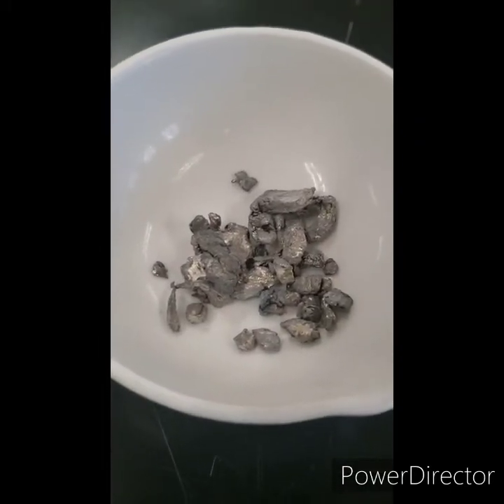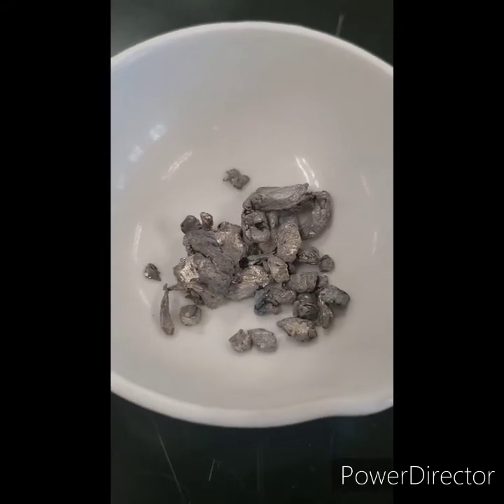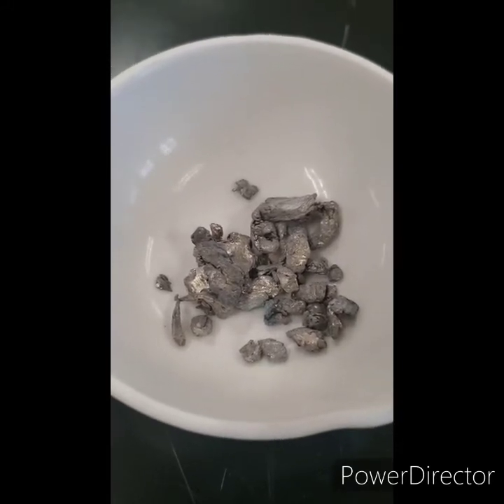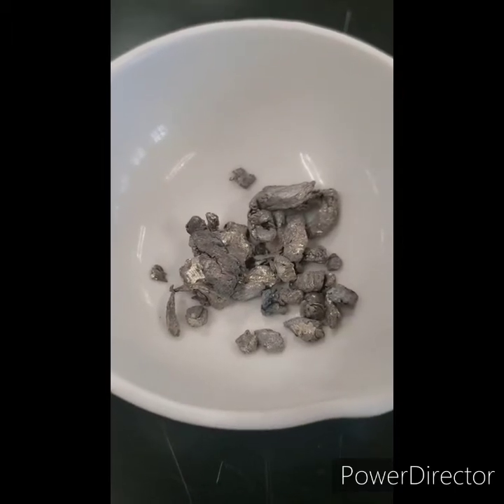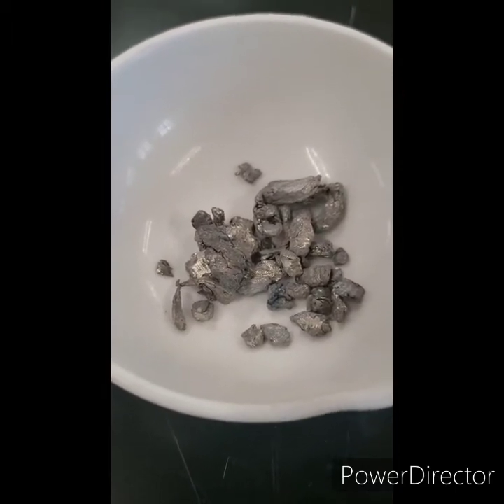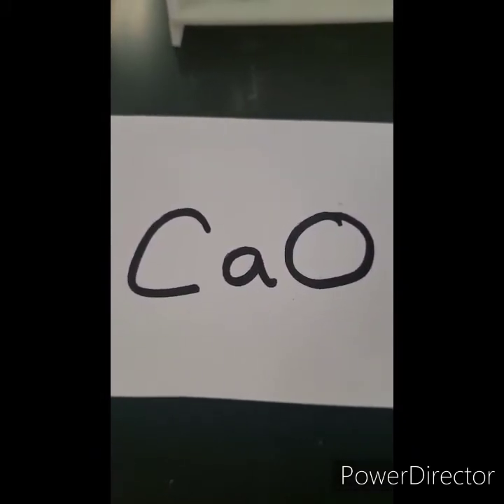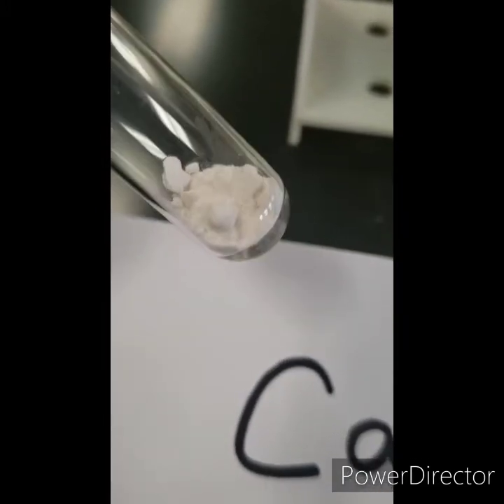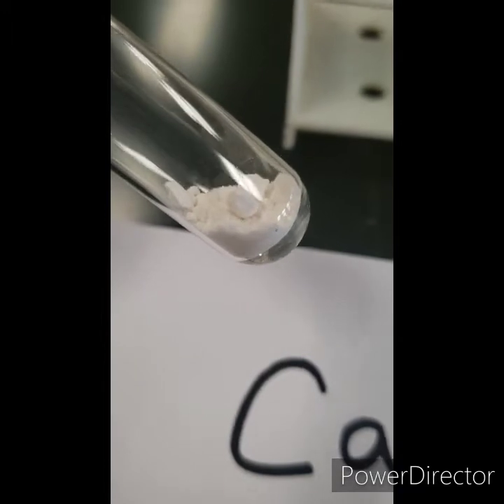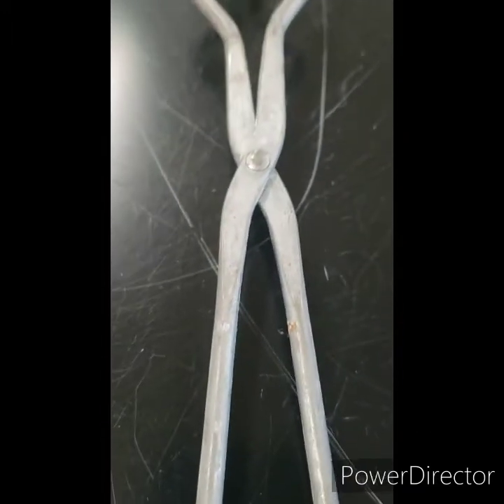This is calcium metal. You can see it has some shiny bits in there. It is very hard and it's silver. Now let's look at a calcium compound — calcium oxide. It's brittle, it's no longer hard, it's very powdery, and it's white.